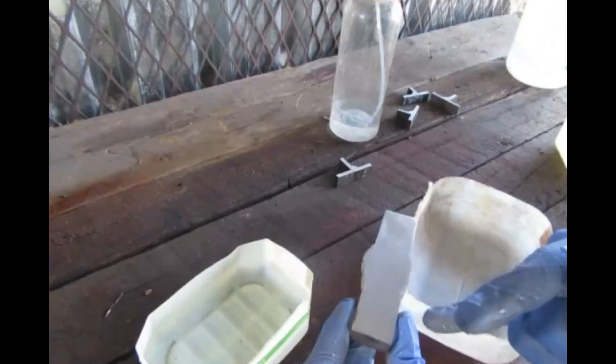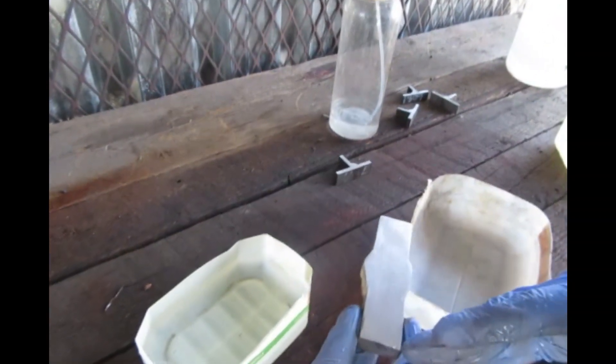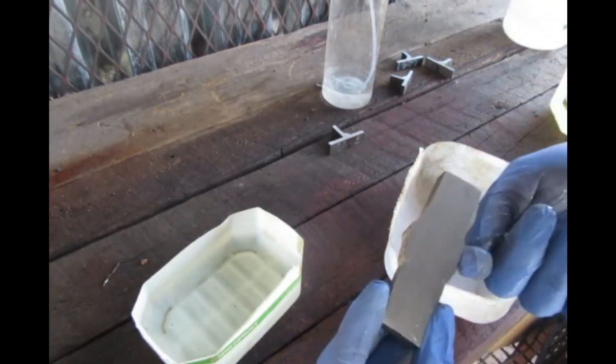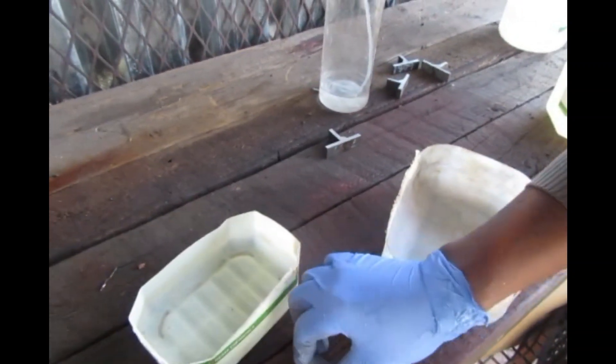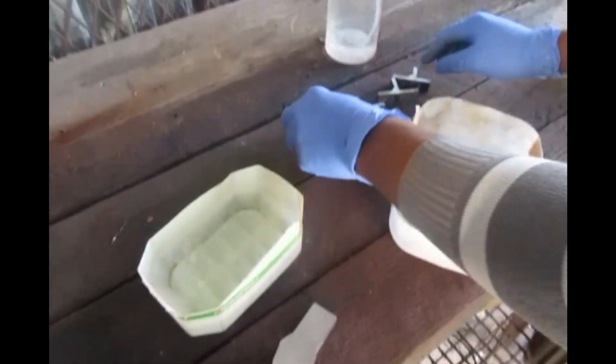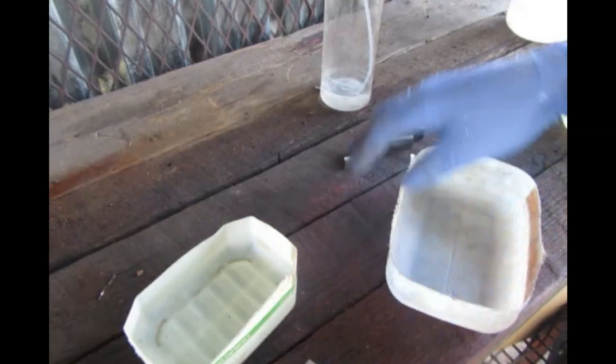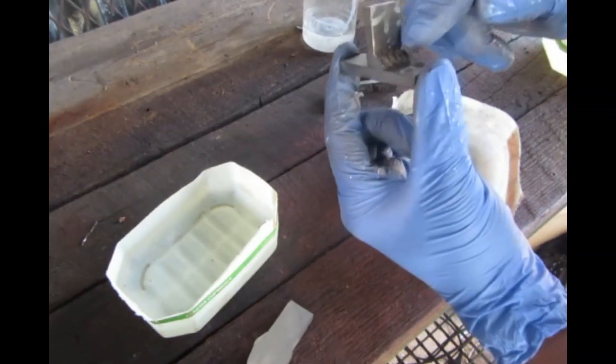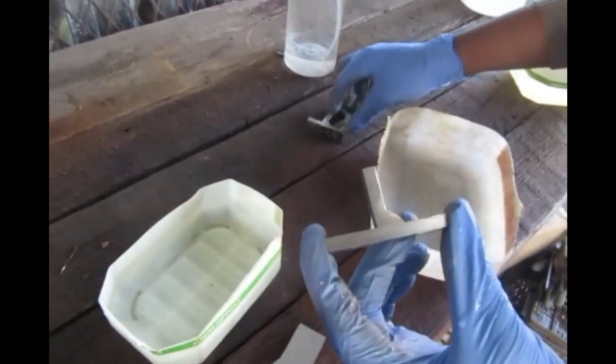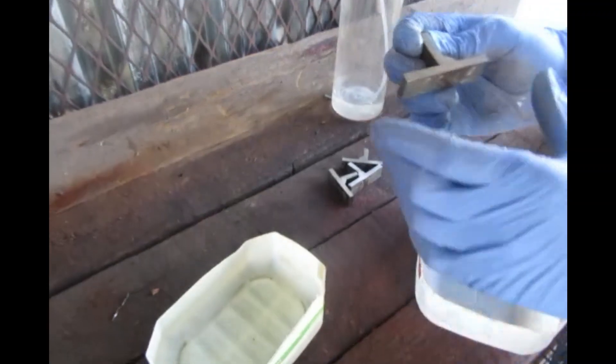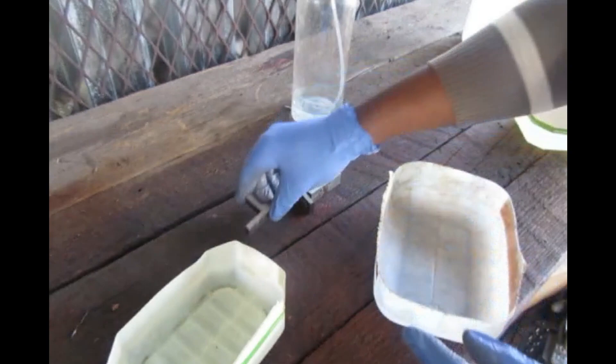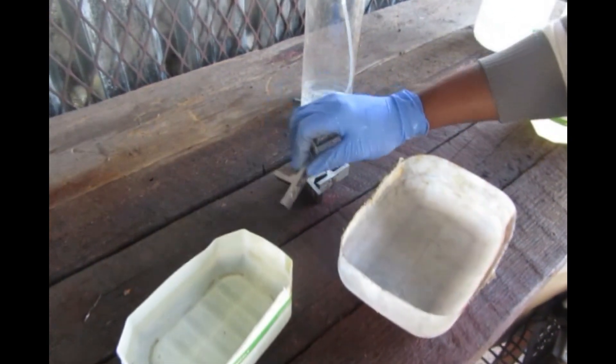This is a butt weld, originally two plates welded together. What you see there is the weld. These are macros. The difference between this macro and these is that this one has a fillet weld. In mechanical engineering, we consider the throat thickness to know how strong the weld is. I want to reveal how the weld looks like after you've welded it and want to do some examination.